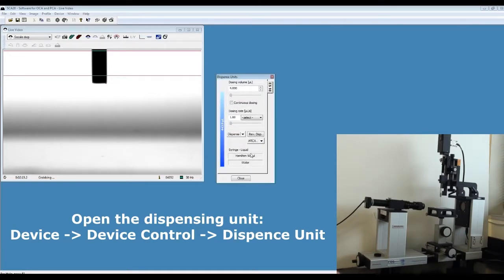Here, make sure the information about the syringe and probe liquid is correct. We are using a Hamilton 500 microliter syringe and the probe liquid is water.